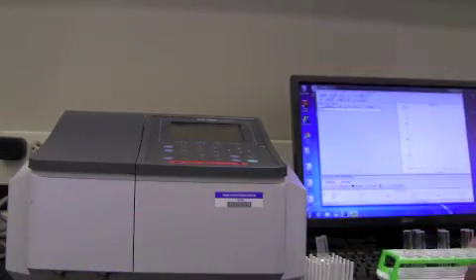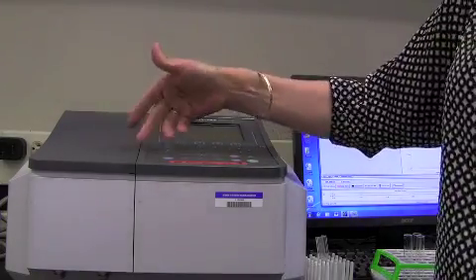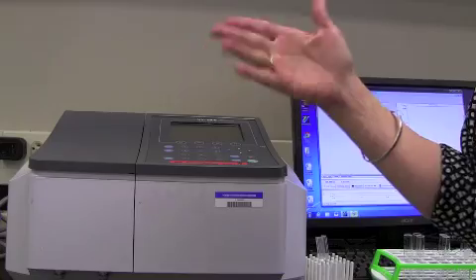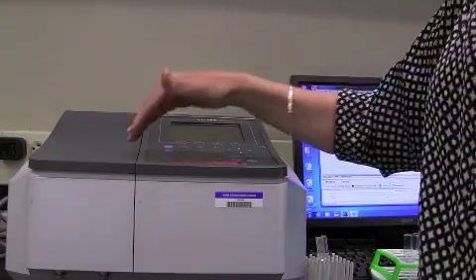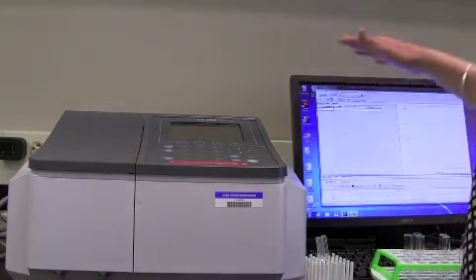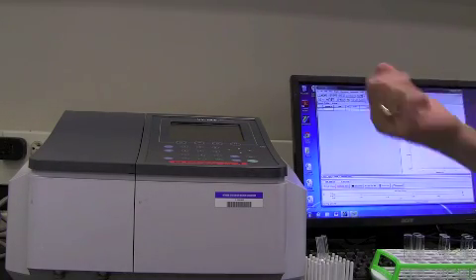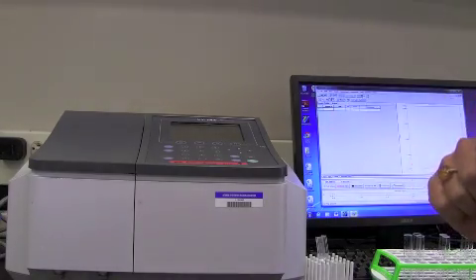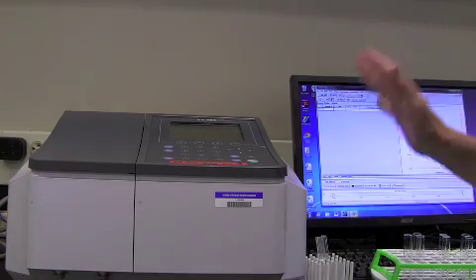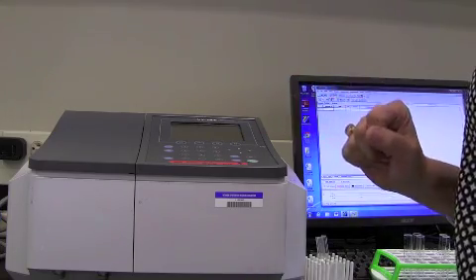And to do that, we're going to use this instrument here called a spectrophotometer. And the spectrophotometer shines light of specific wavelengths. You choose the wavelength to shine through depending upon the nature of your sample. And then it measures how much of that light gets absorbed. And it then reads out here on the computer as an absorbance value. The first thing you need to do is to zero the spectrophotometer. Now, don't worry too much about all the details here, because when you get to this in the lab, we're going to be working very, very closely with you to help you to use these machines.